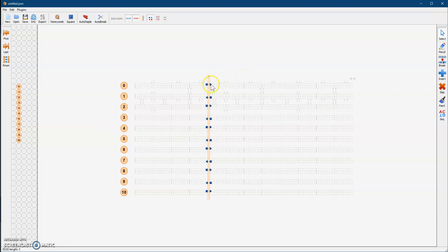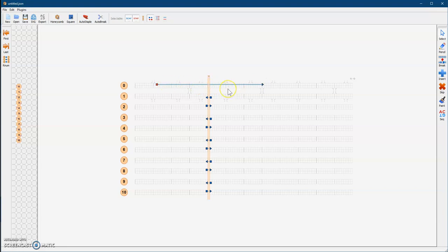What we want to do is stretch these strands out. We could do this by dragging the ends, or a much simpler way to do all of them is by holding the shift-alt key together and then double-clicking on the slider here.